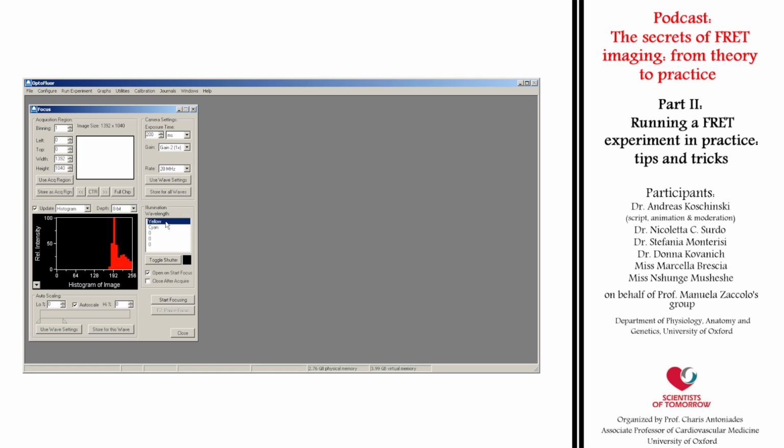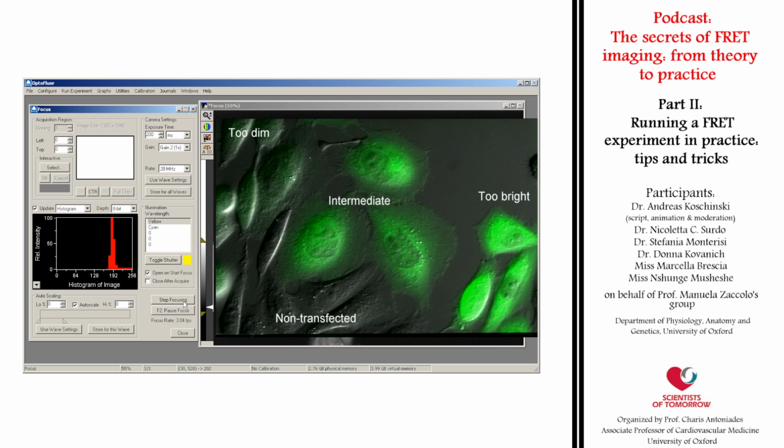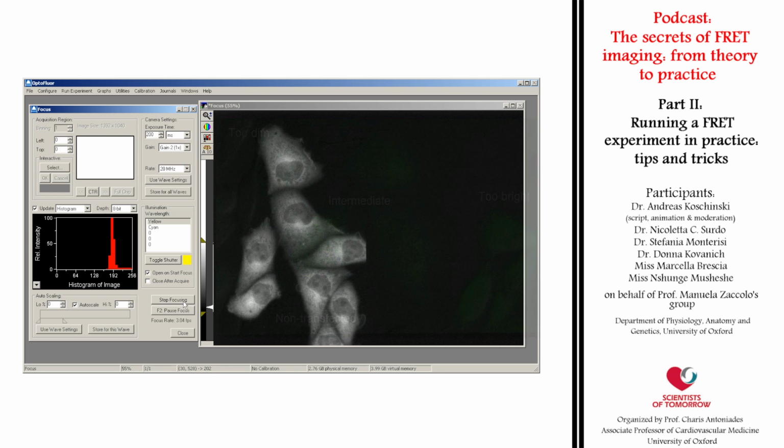However, be aware that if you do this in fluorescence mode, the cells are illuminated all the time, which will considerably stress them and might bleach the sensor. Therefore, it's better to look for the cells directly through the eyepieces and to focus only after you found a cell suitable for your experimental question. You should not use cells which are very bright or cells which are extremely dim. To narrow down variations, try to always use cells comparable in morphology and fluorescence intensity.